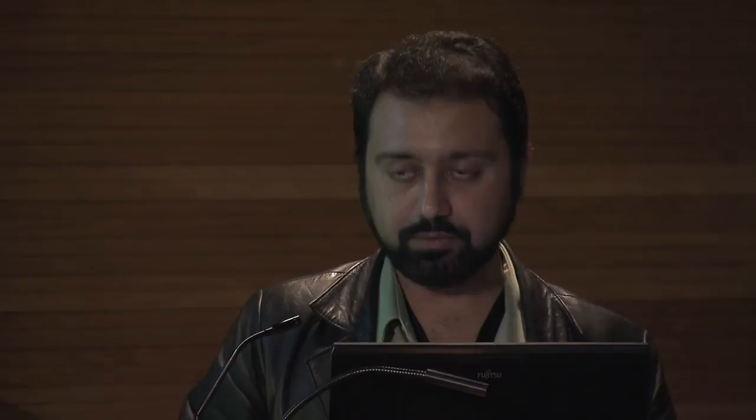We investigated that, and with some legwork eventually found out this was a discrepancy between male patients and female patients. Only kidney cancer so far has shown this huge dichotomy between male and female patients in the DNA methylation data. It's not terribly surprising — thinking about the X chromosome, in females one of the X chromosomes might be turned off. We removed sex chromosomes from this particular analysis, and when we did that, a new dichotomy appeared across batch boundaries — batches 65 and 32 on top, and 50, 64, and 69 at the bottom. This was done using the MBatch R package.